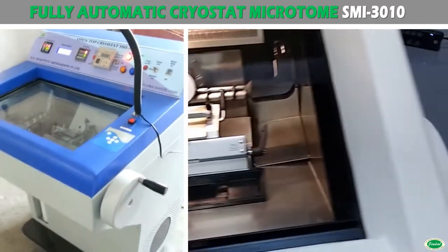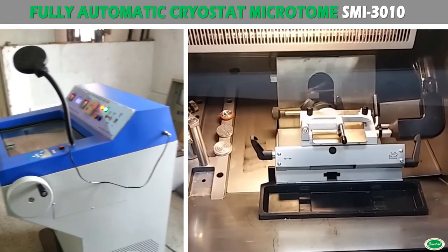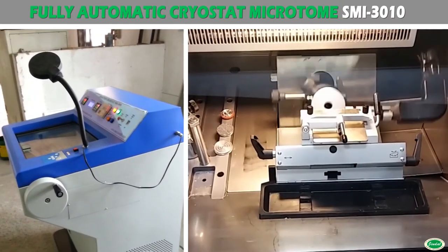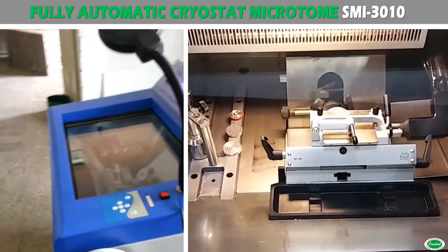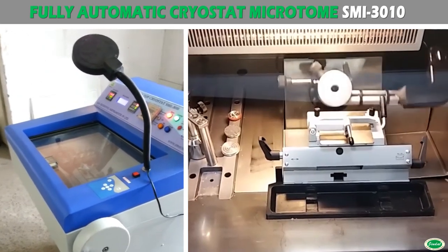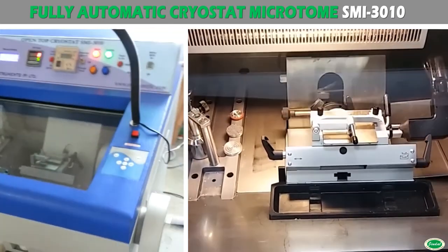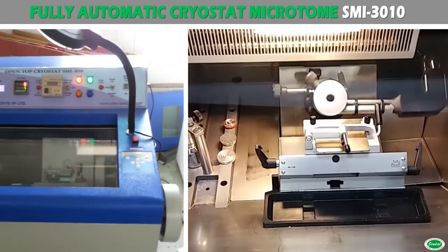The spacious inner chamber is made of polished stainless steel with a sliding acrylic transparent door. A lamp with an inbuilt magnifying glass is also provided, which switches on automatically whenever the door opens to facilitate easy visibility. A microtome hand wheel is provided outside the chamber on the right hand side for easy operation.